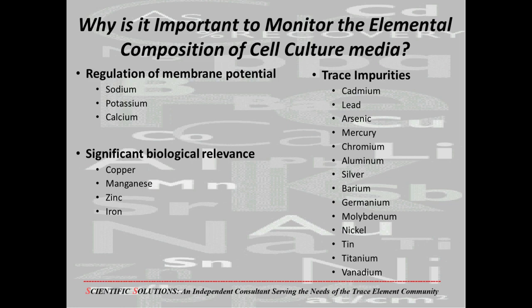It is well recognized that variability in cell culture media in the processing of biologics can lead to quality control failures and a reduction in yield. With metal ions having an important role as enzyme cofactors, their variation can influence the growth of cultured cells. The concentration of metals can range from low parts per billion up to tens of parts per million.